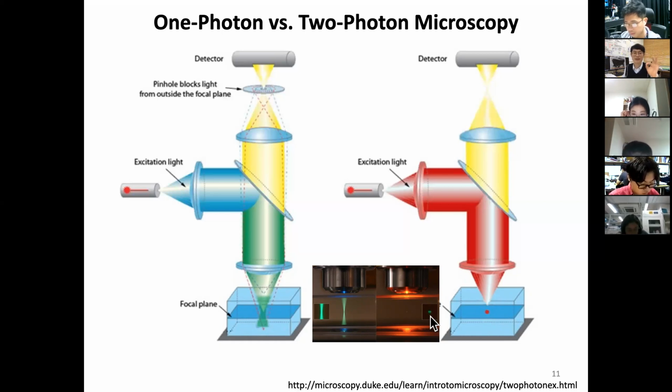Why does this happen? Because this is a nonlinear microscope. And think about your basic knowledge of physics. Many things in life look linear, but in fact, everything is nonlinear. You just don't notice it much. However, when things are under specific conditions, for example, when you focus light, let's say fluorescence happens when an excitation photon gets onto the fluorophore, it excites the energy state and the energy goes back, and it emits another emission photon, which is longer wavelength.